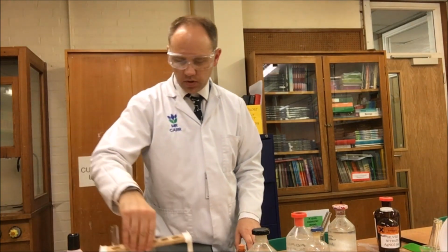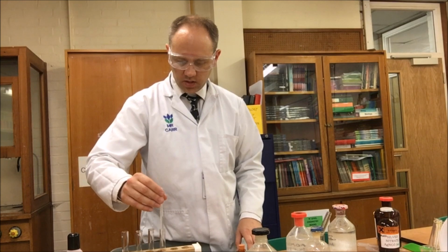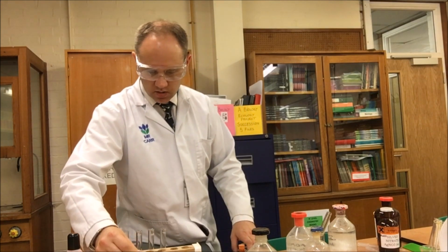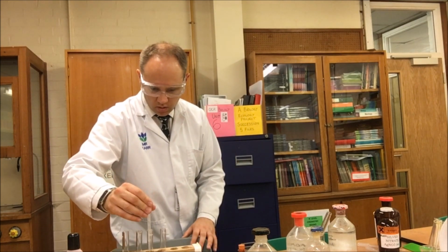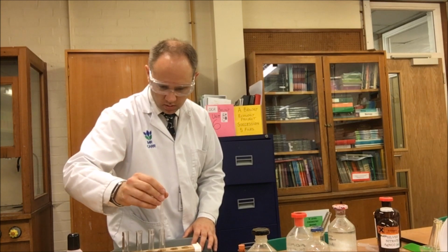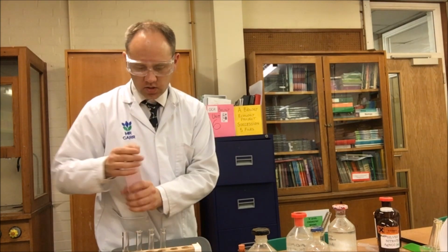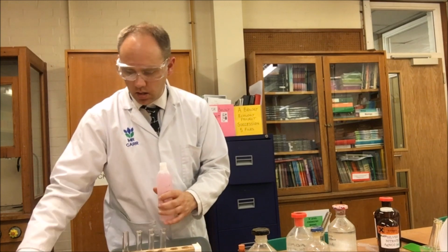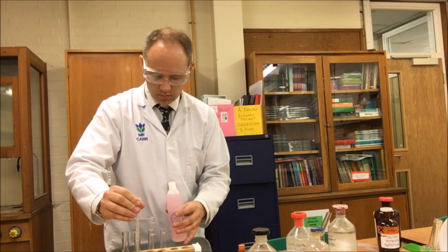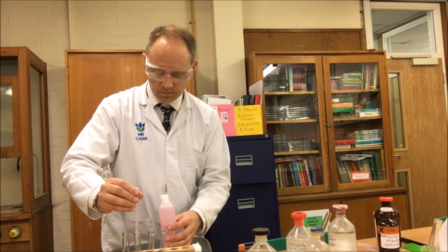So we need to put a little bit of each into one of these, and the same amount into the next. So the sugar is in these two here. The acetone will be in the test tubes on the right. We don't need loads, but we need enough to be able to get the job done.